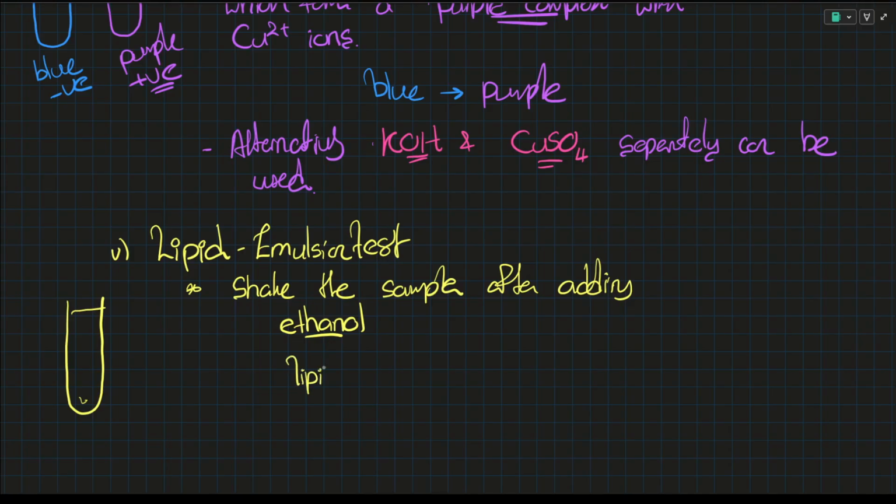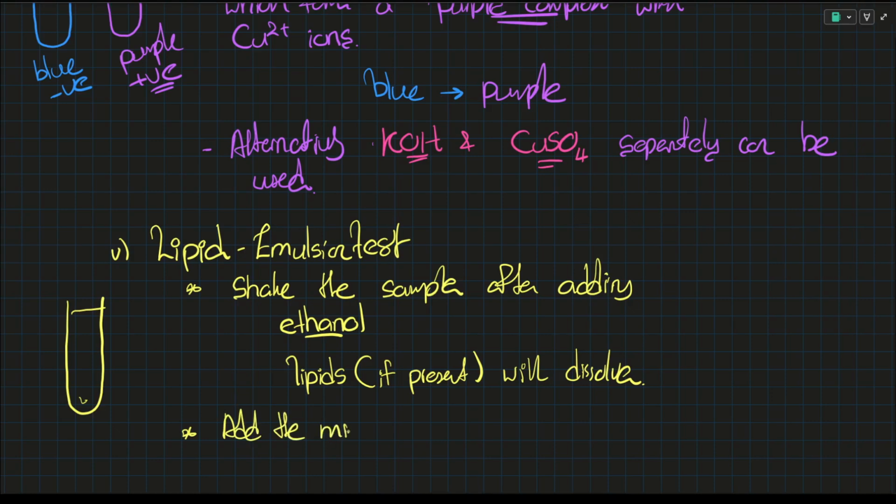Then, if lipids are present, they will dissolve. Lipids are not going to dissolve in water. Lipids are going to dissolve in ethanol. So what exactly do you do afterwards? After these lipids are dissolved, you have to add the mixed sample to a beaker of water.